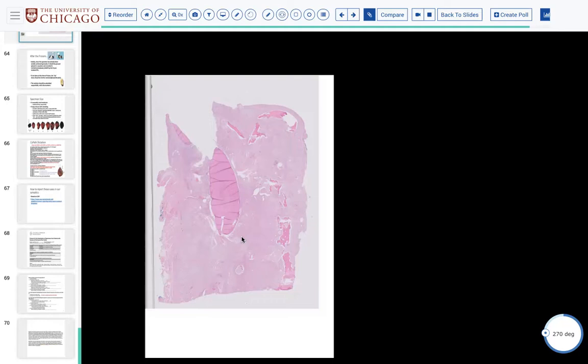Always be mindful of the areas that they are more clinically concerned with. Sometimes they say, oh, I'm concerned about this area. Say, okay, great, I will look at that area. I'm also going to look at the rest of the specimen as I normally would. So take what they say into account, but don't let it completely destroy your normal standards of processing that we have.